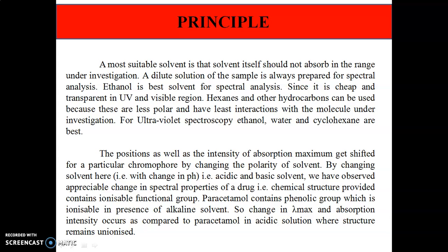On the other hand, in some cases, the excited state may form stronger hydrogen bonds than the corresponding ground state. In such cases, a polar solvent shifts an absorption band to a longer wavelength, since the energy of the electronic transition decreases. A polar solvent shifts the transition of the pi to pi antibonding type to a longer wavelength.